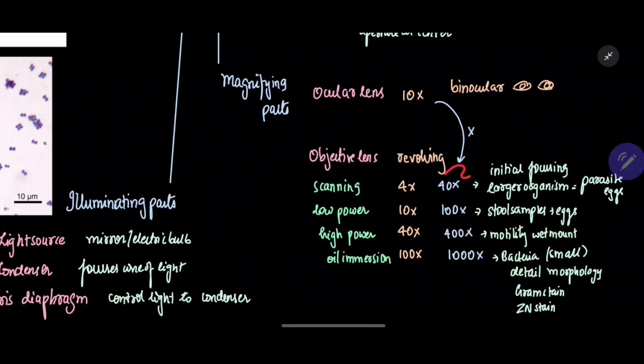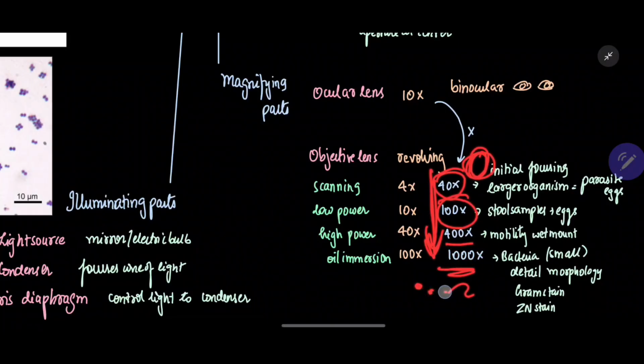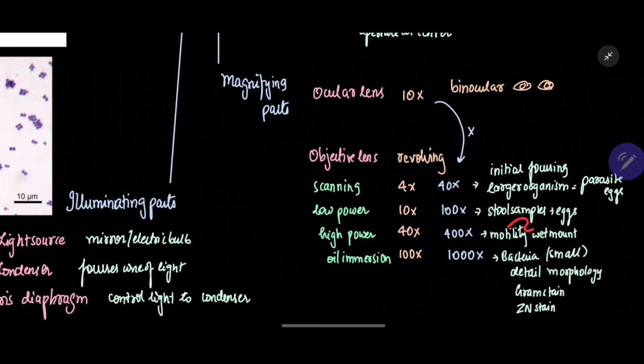So imagine this is increasing, right? That means here you are able to look at organisms that are bigger. Here you will be able to look at organisms that are very tiny. So next, moving on to your high power.